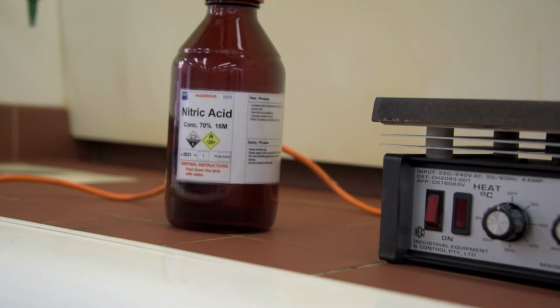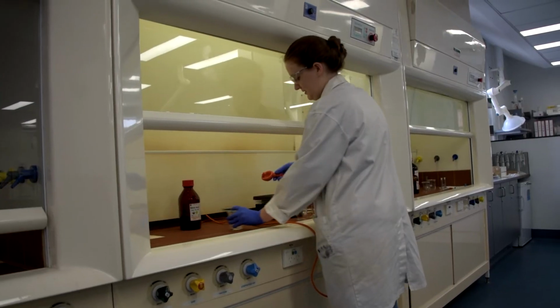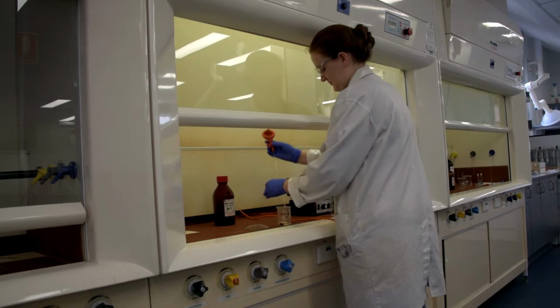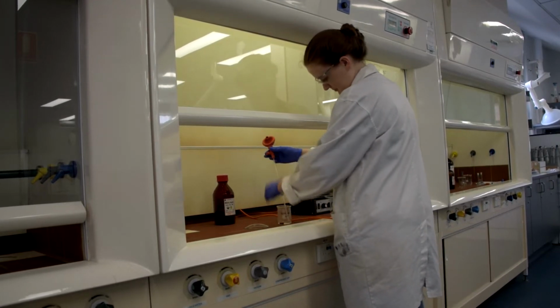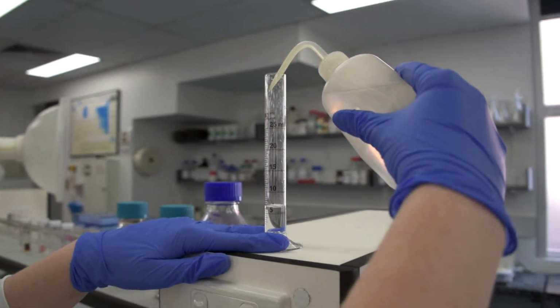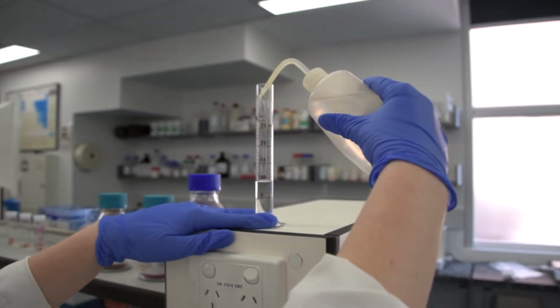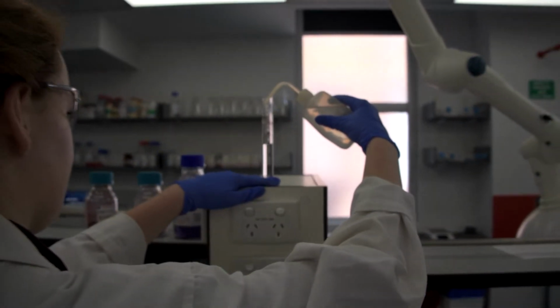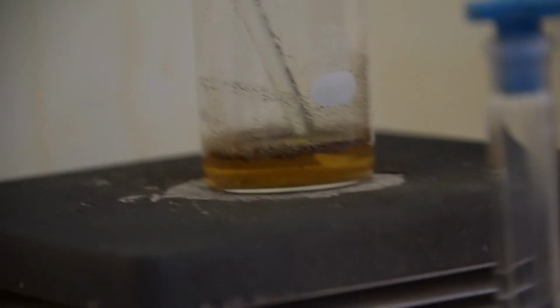Once the sample was weighed into a beaker, a solution of nitric acid was made. A 2 milliliter sample of concentrated nitric acid was placed into a beaker. To do this, a 2 milliliter Class B volumetric pipette was used. Using a measuring cylinder, 25 milliliters of water was measured out and mixed with the 2 milliliters of nitric acid. This acid solution was added to the sediment sample.